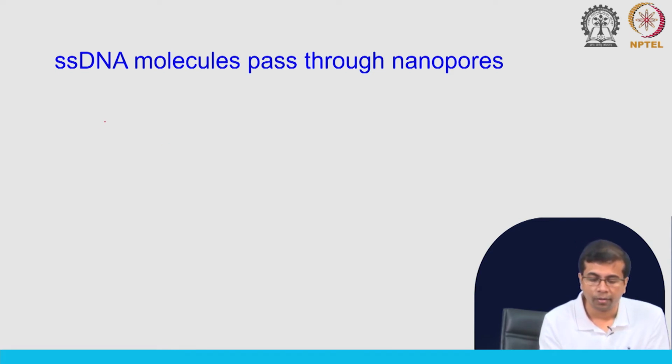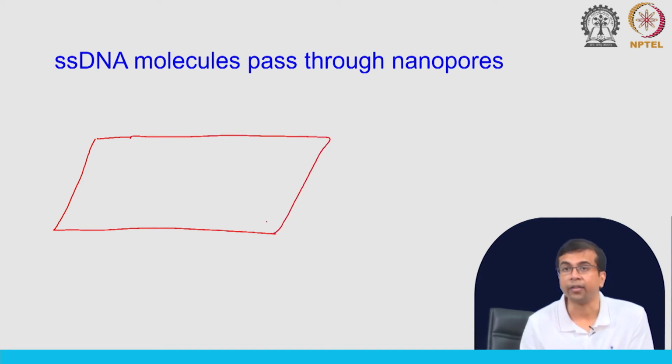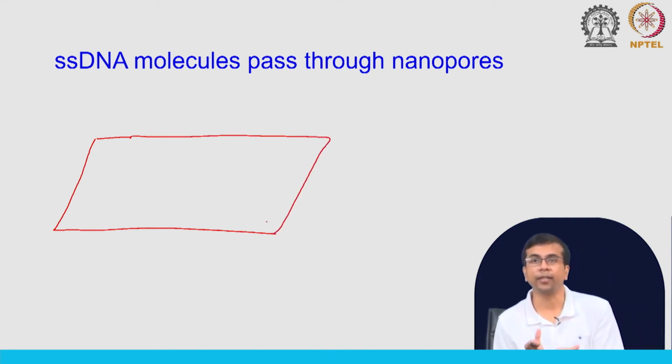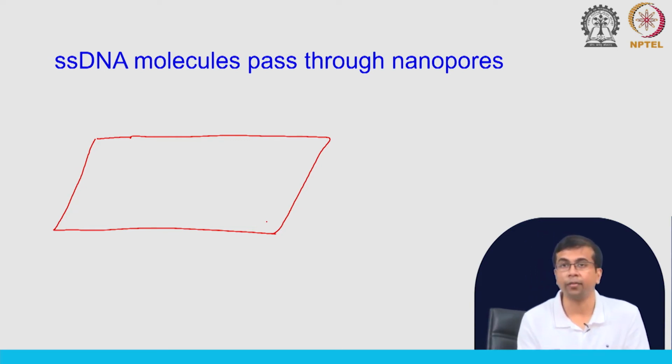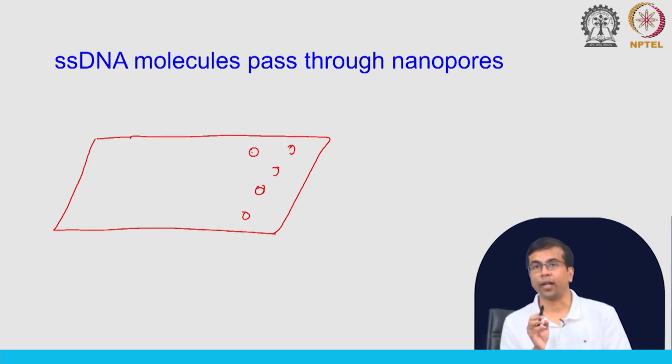You can imagine a flow cell. The sequencing happens inside the flow cell. You need something like this, either a SMRT cell, a flow cell as we have seen, or picotiter plates. Here you have a flow cell where the sequencing happens, and on this flow cell you have millions of these very small pores, and these are called nanopores.